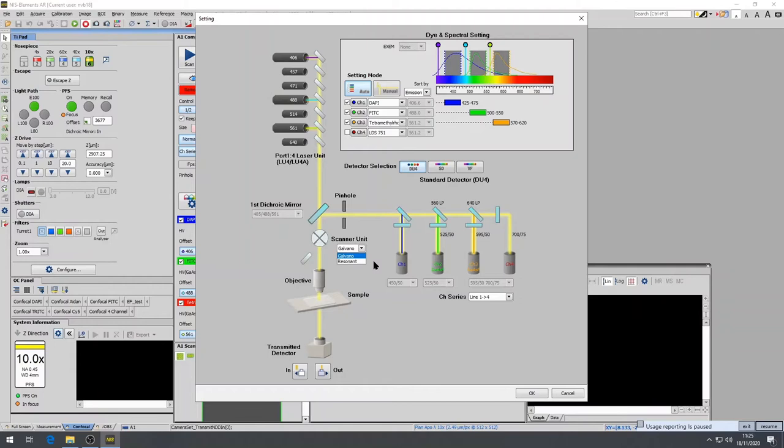The other option is the resonance scanning, which is recommended for imaging fast biological processes or those that are light sensitive. It has a lower scan size when compared to galvano scanning.